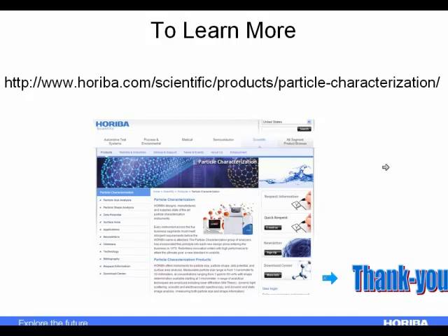All right, so we have our first question. Ryan asks, what was the name of the equation that had the RH particle size calculation? So I'm guessing that's hydrodynamic radius? Maybe not, though.